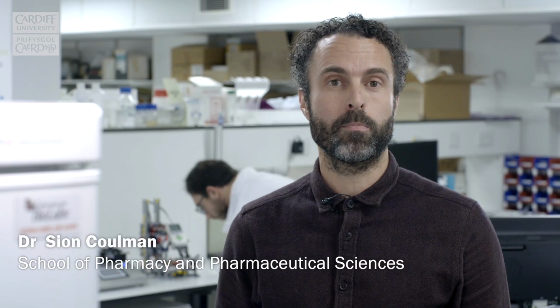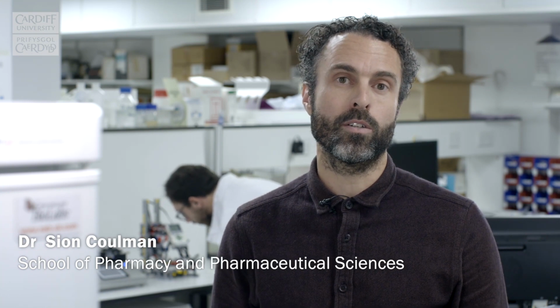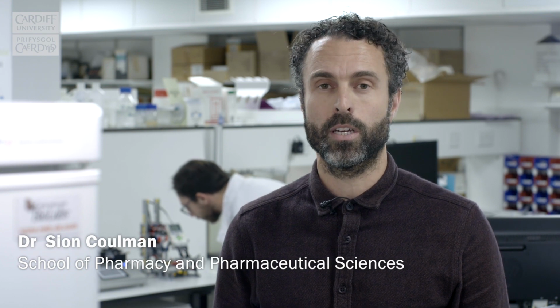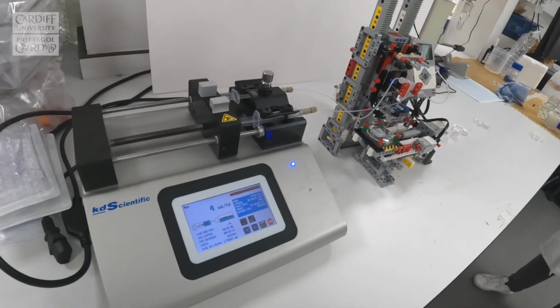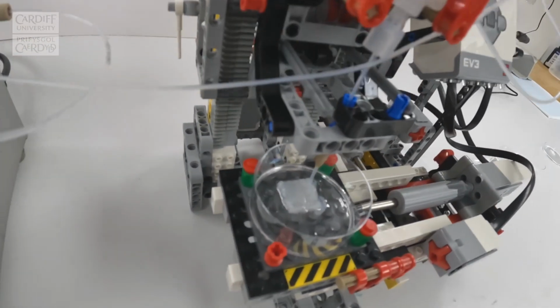What this project has been all about really is changing the work that we do from experiments in two-dimensional cell culture to three dimensions. It's normal in science to grow cells in a layer at the bottom of a plate, and to use those cells to study their biology, to study disease, and to work out how drugs work.